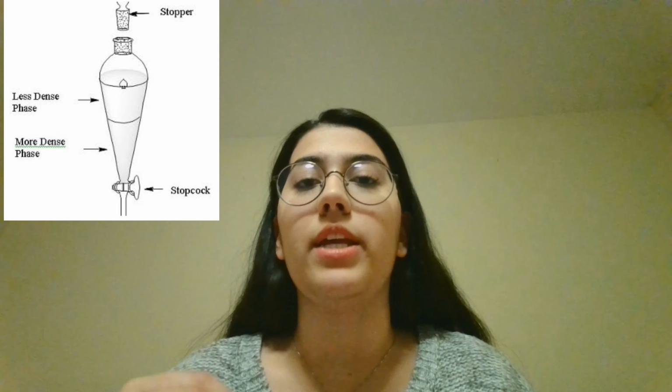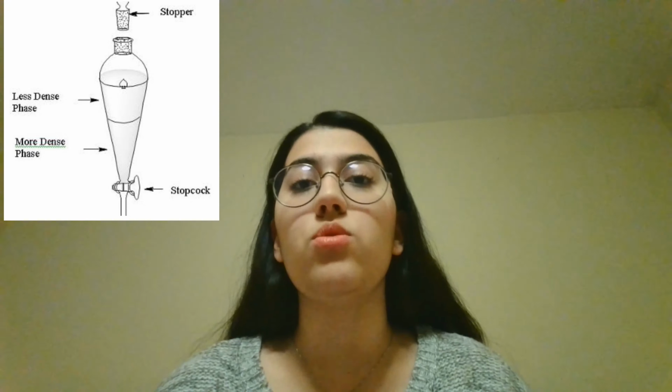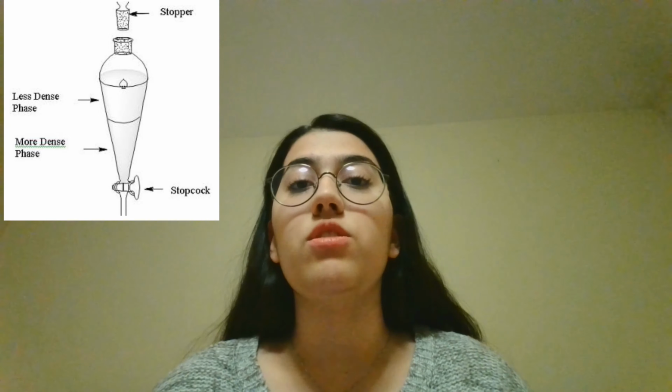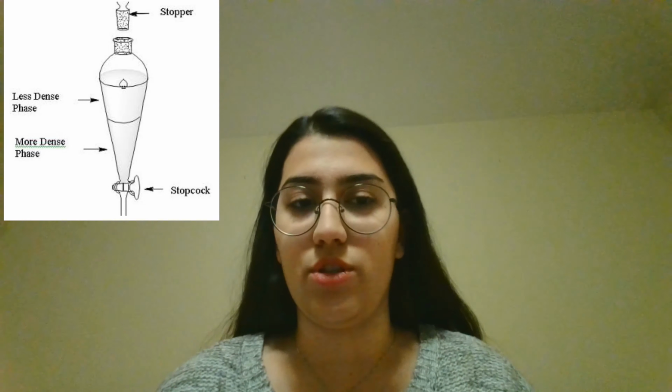Extraction dissolves the desired compound and leaves the contamination and impurities behind, while washing is able to clean the desired compound by dissolving the contamination and impurities and leaving our desired compound behind. For performing these techniques, firstly, we need to secure a ring clamp by connecting it to a ring stand, and then placing our separatory funnel on top of it. We need to make sure that our stopcock is closed before adding our solution to the funnel.